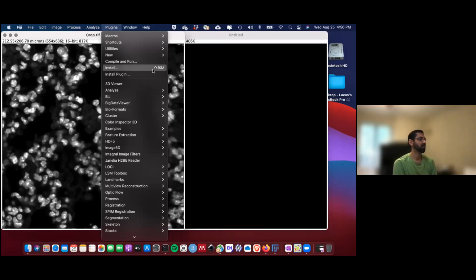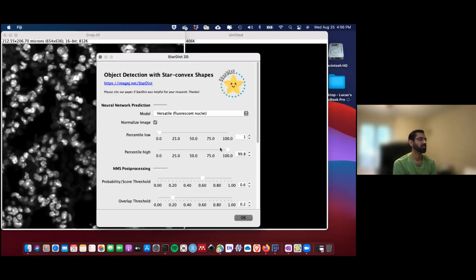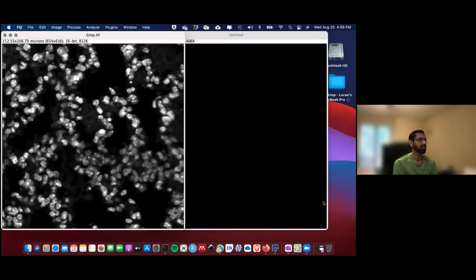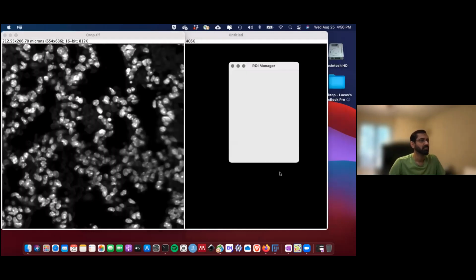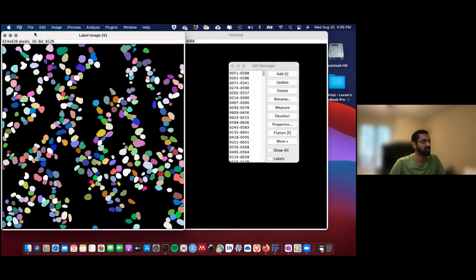Where are you? Scroll down. This guy. All right. So let's say that we go like this. I think that was the original setting. There we go. Wonderful. And now let's enable show all and show labels to see how well it looks or not. So if you can minimize the label image.